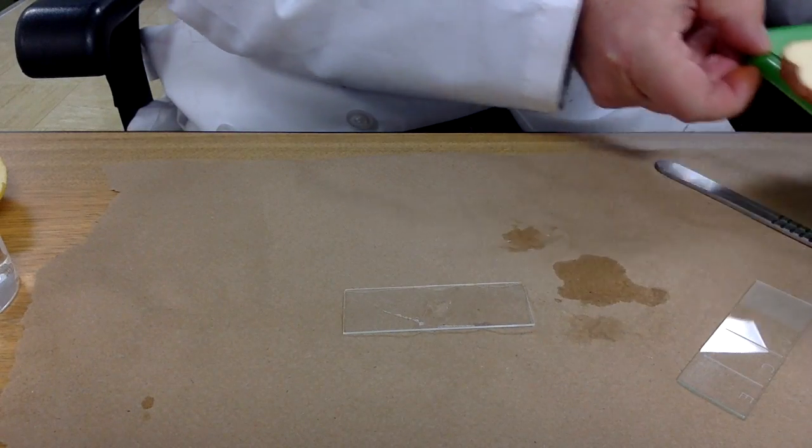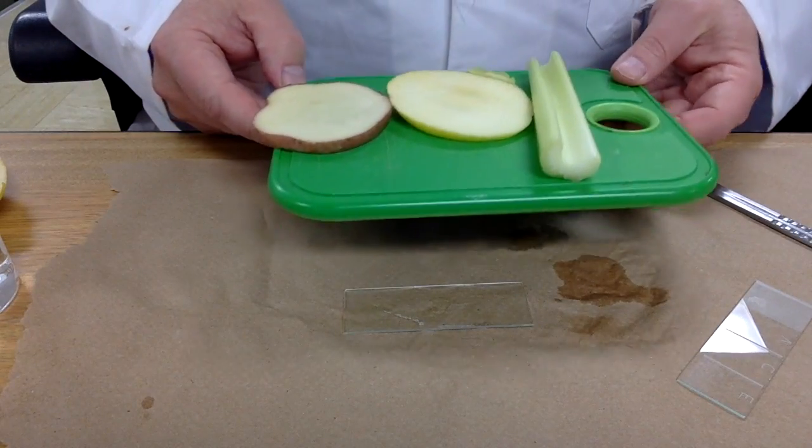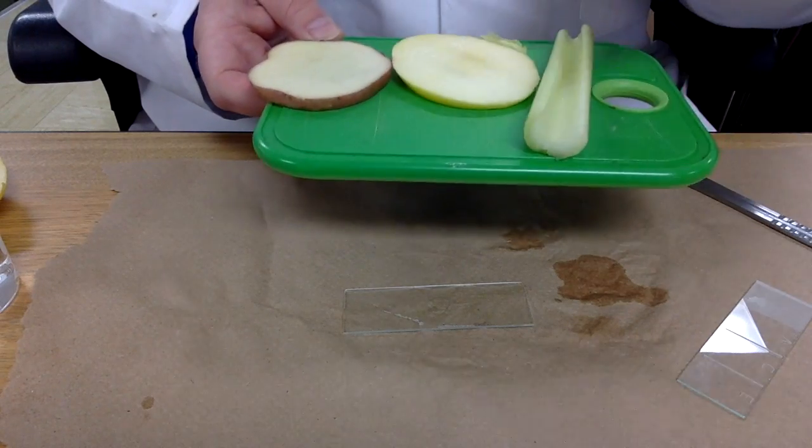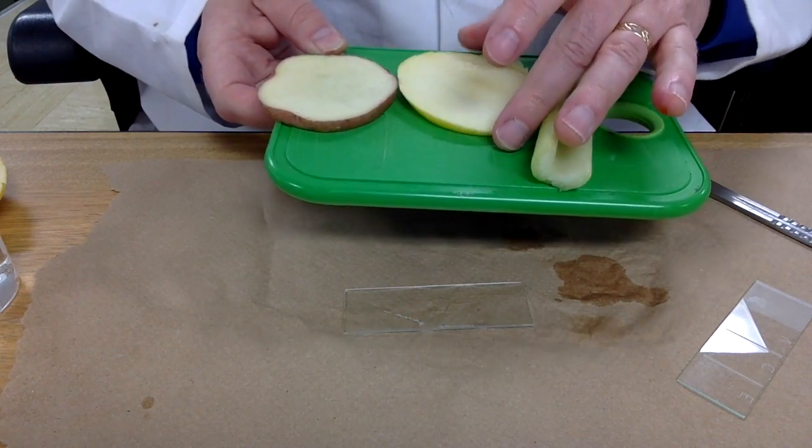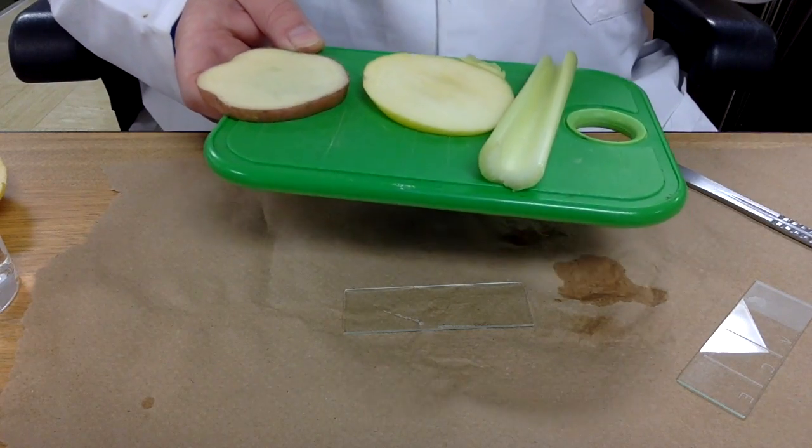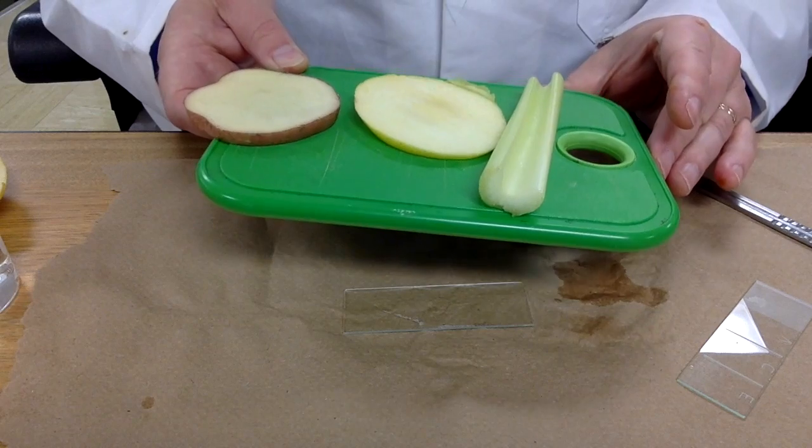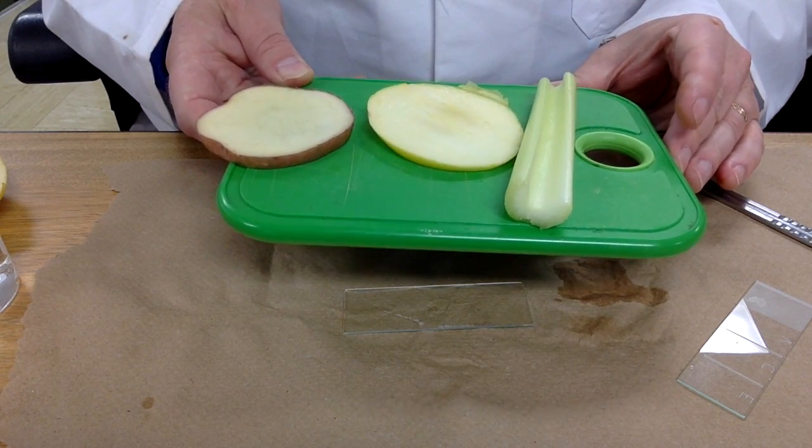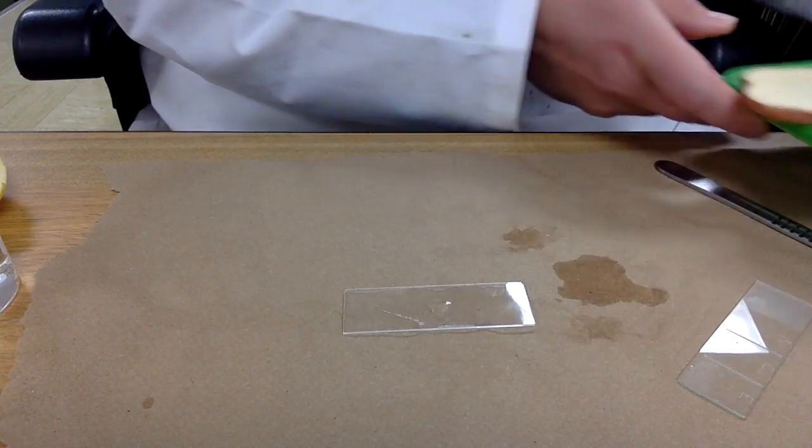You will find at the cutting board stations that we have some celery, some apple, and some potato. The apple has some yellow skin on it today and we have a red potato. You can take opportunities to look at both the skin and the central area of those fruits.